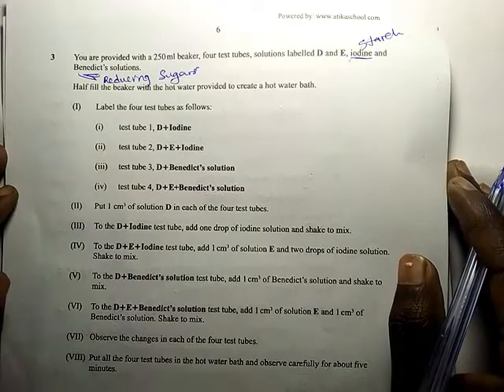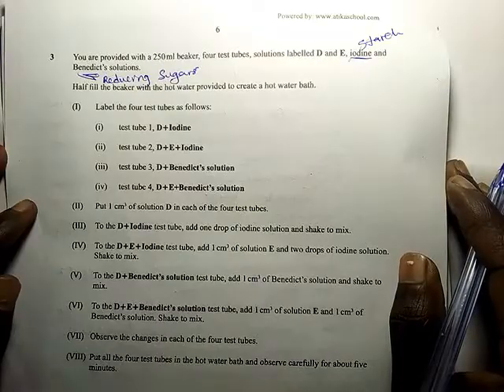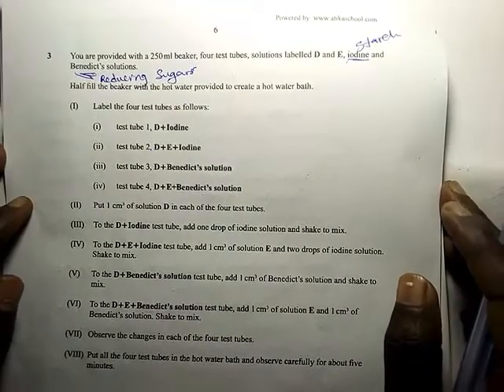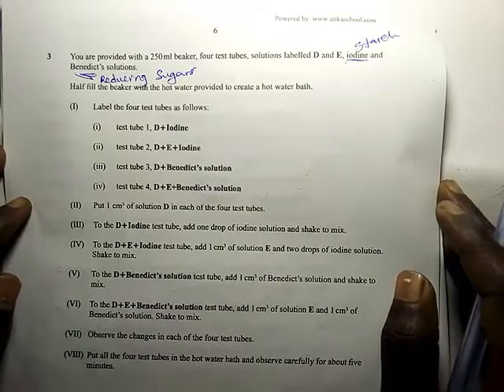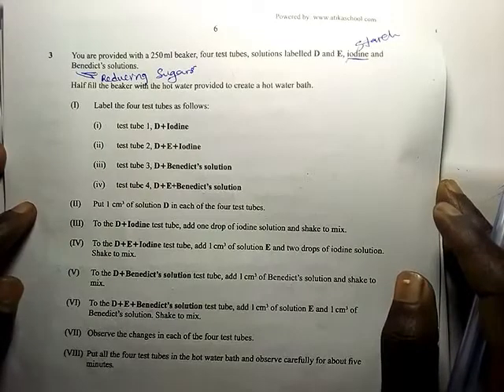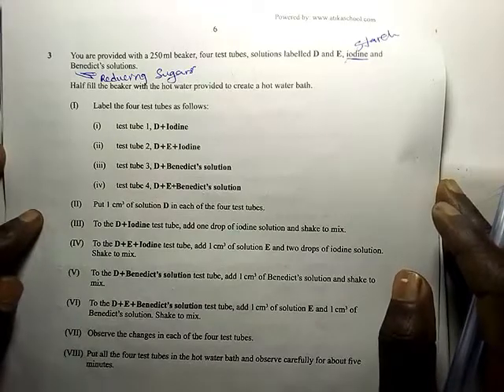One, label the four test tubes as follows. Test tube 1, D plus iodine solution, that is solution D and iodine solution. Roman 2, test tube 2, solution D plus solution E plus iodine solution. And Roman 3, test tube 3, solution D plus Benedict solution. And Roman 4, test tube 4, solution D plus solution E plus Benedict solution.